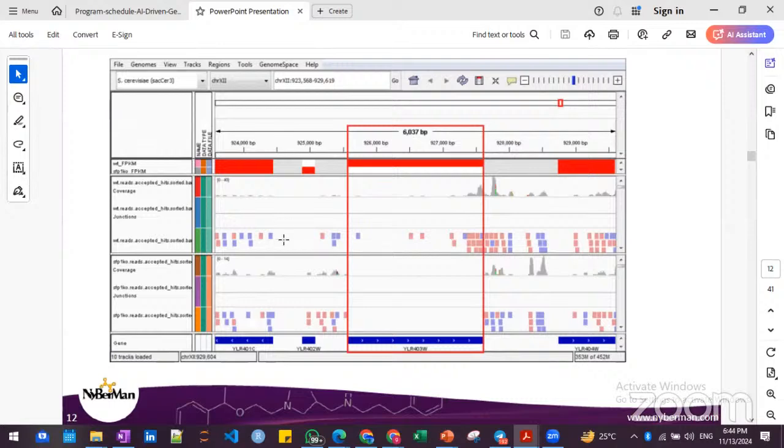Like this, one sample is on the top where some reads are there, for example we say it is reference reads, and then the second sample we see here is your disease sample, for example. So you can see in the reference genome, like a reference read on the top, there are reads, right? There is a blue read here at this position, and then two red reads are shown here, then again some reads are there. But when we see right below in the disease sample, there are no reads, right?